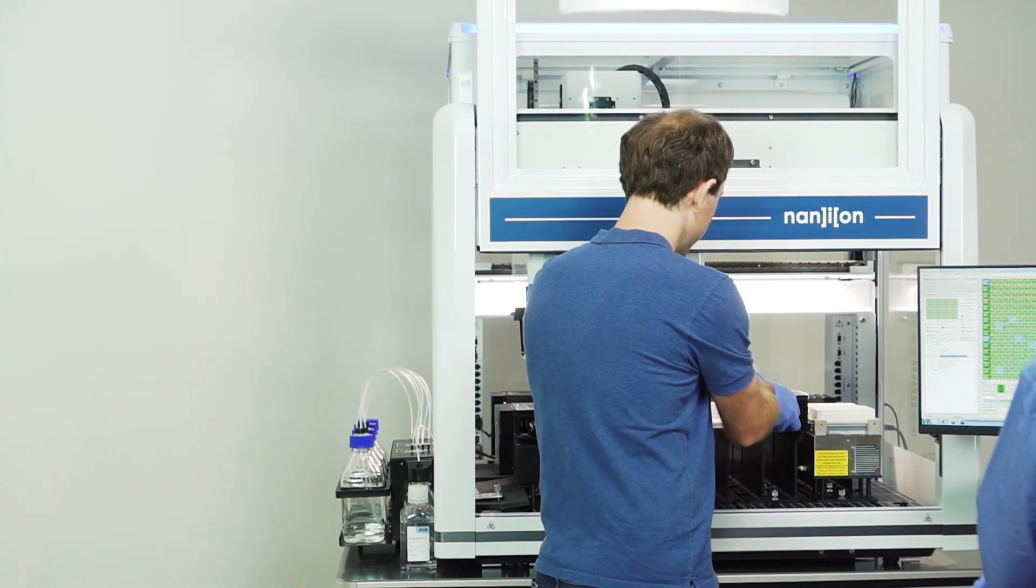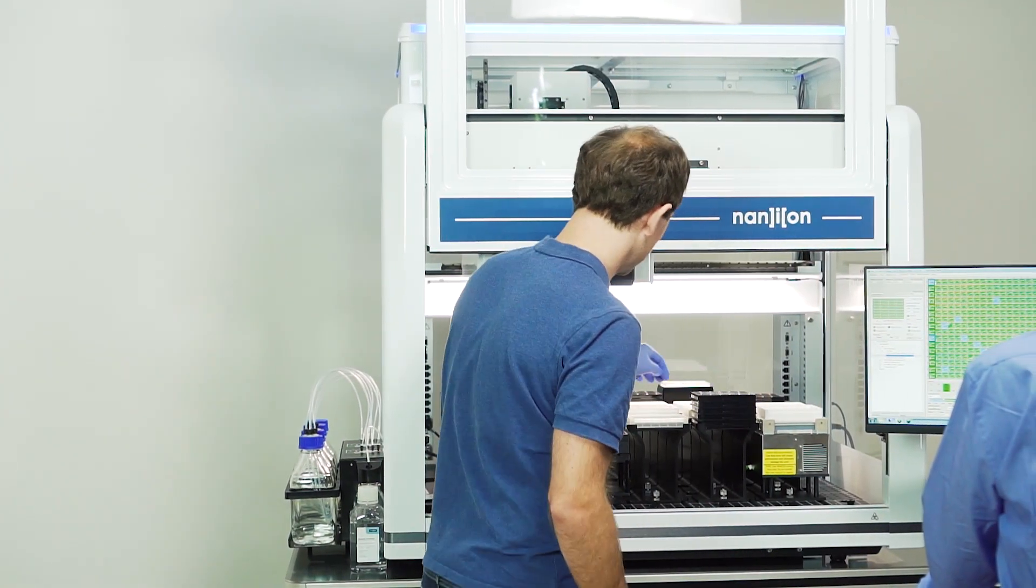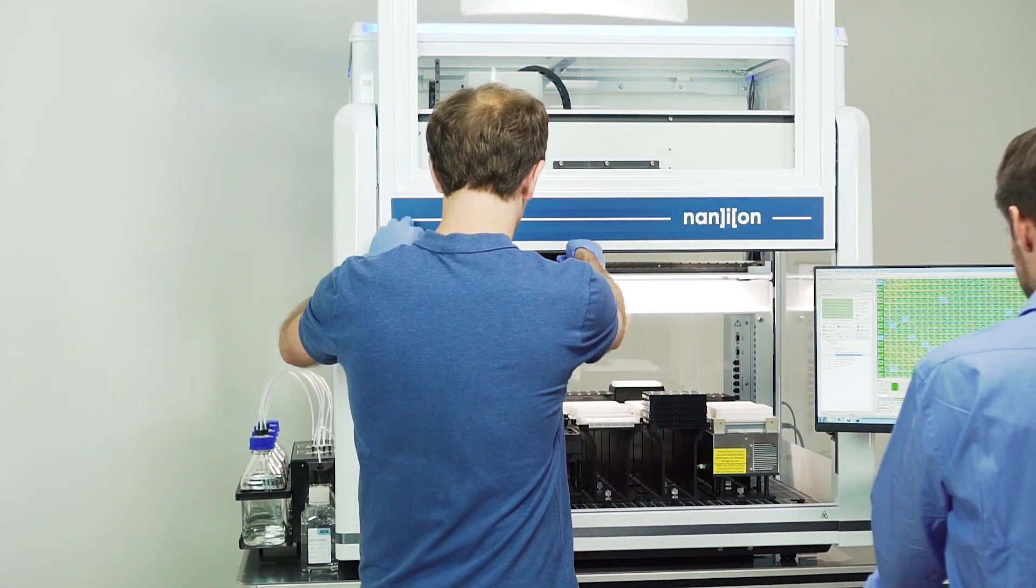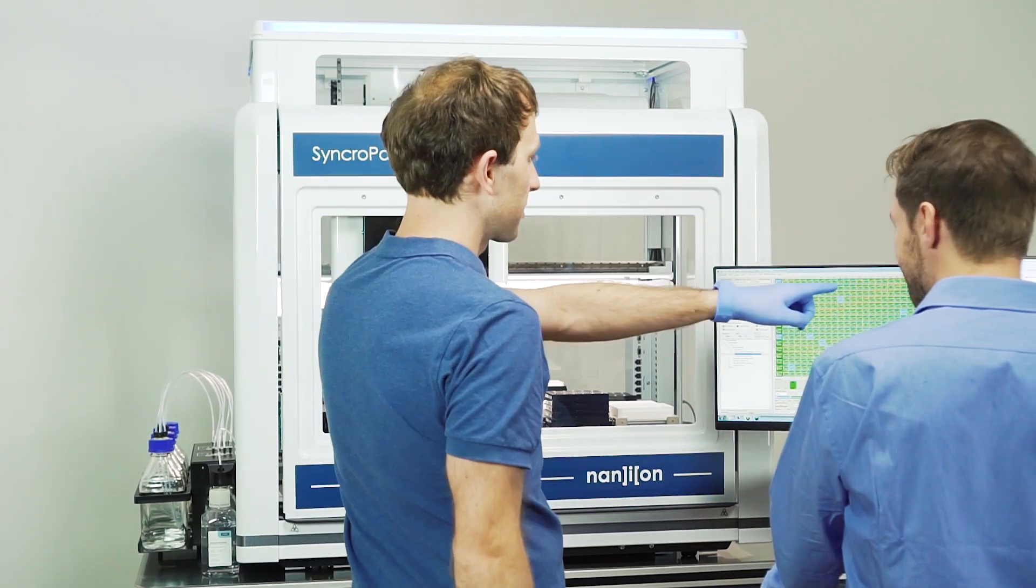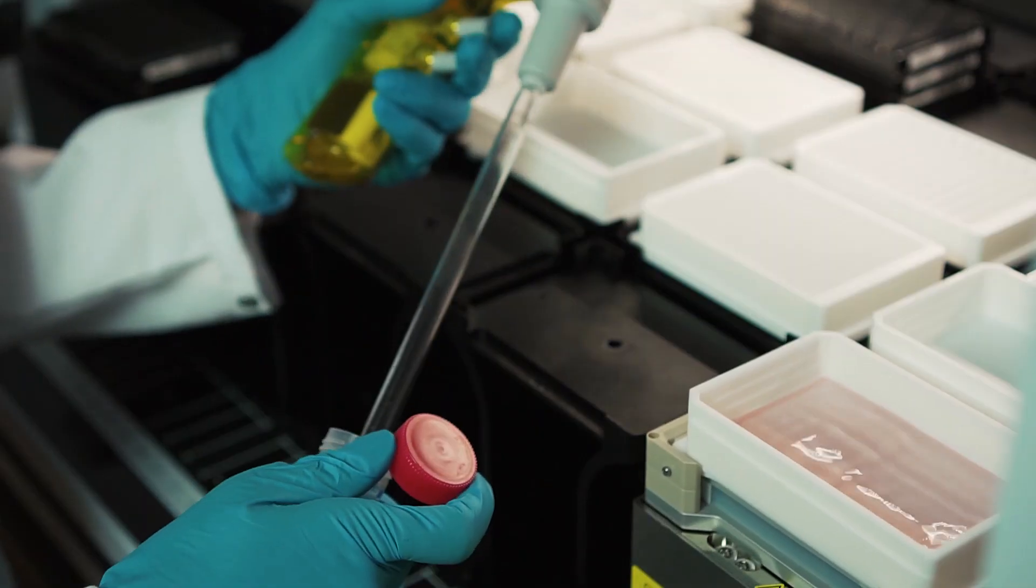The Synchro Patch 384i is ideal for all your ion channel screening projects, regardless of whether you are working on complex biophysical properties in an academic lab or drug screening in industry.